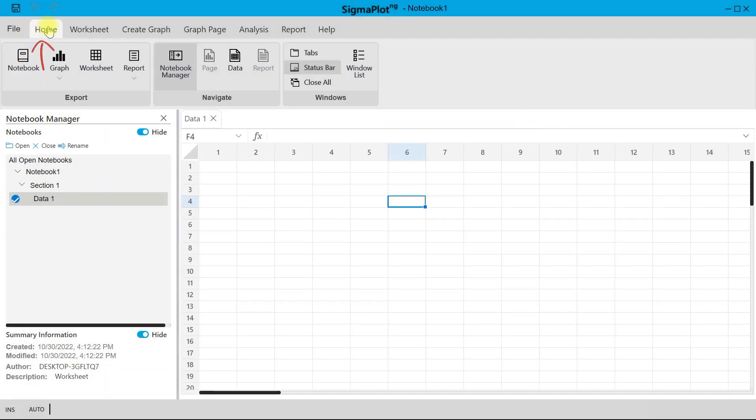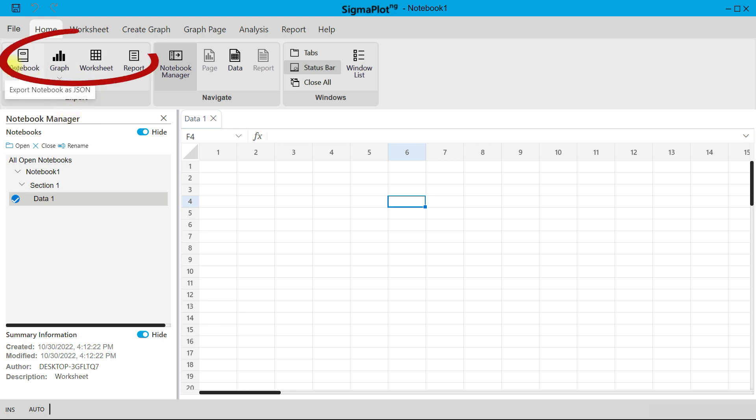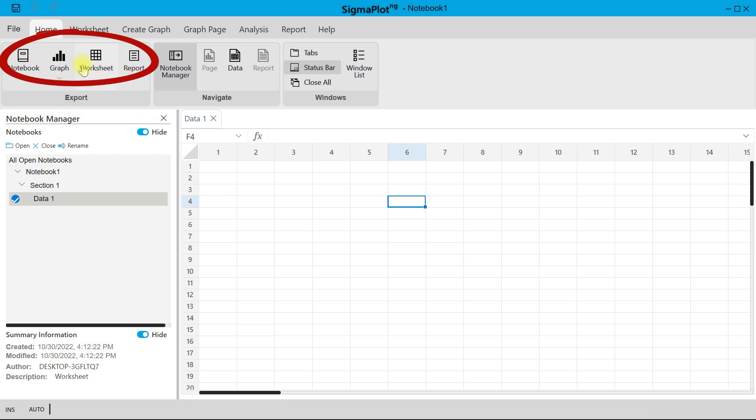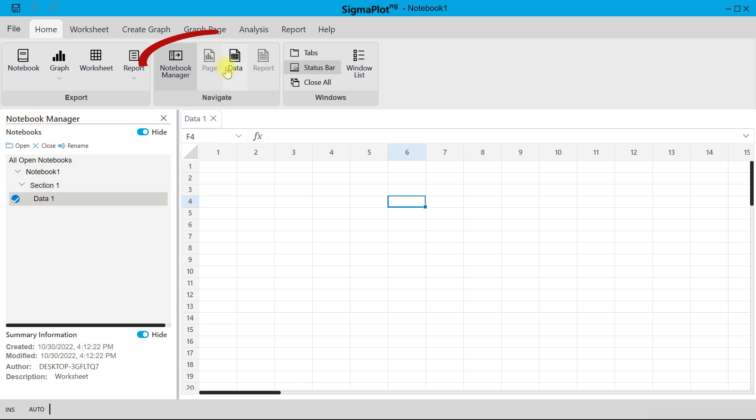Then you come to your Home button. Under Home, there are also quick tools that you can explore. Under Export, you can quickly export a notebook, you can export a graph, all in this area. Then you can also choose Navigate. You can navigate to your Notebook Manager area, you can navigate to your page or data and report very easily and quickly from this point.